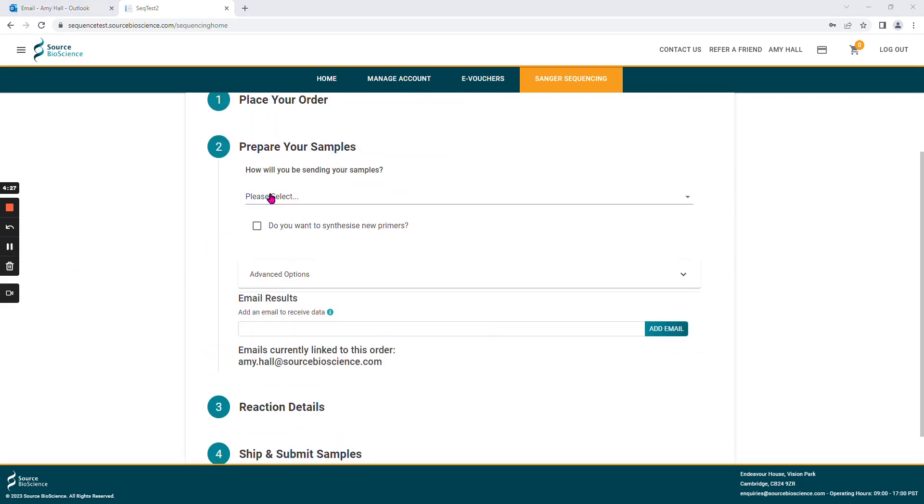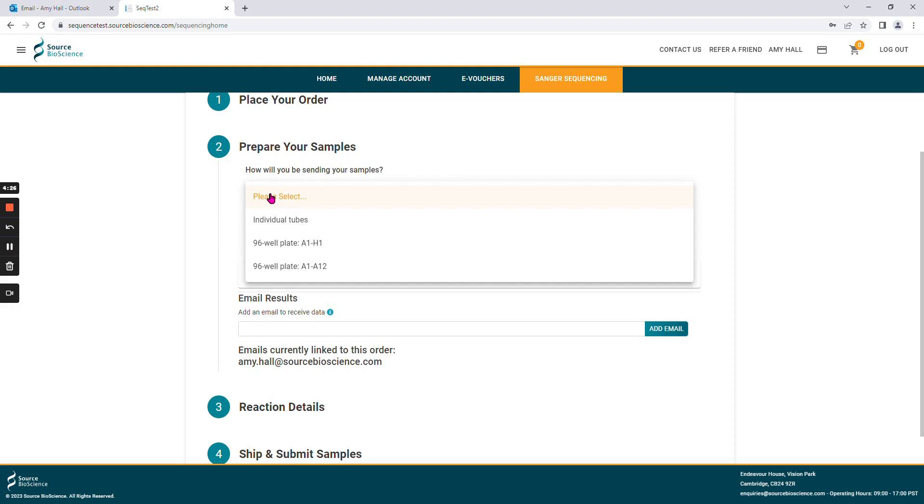Please select from the drop-down list how you wish to send your samples to us, whether that is in tubes or in a 96-well plate, but please do ensure that orientation of the plate is correct.